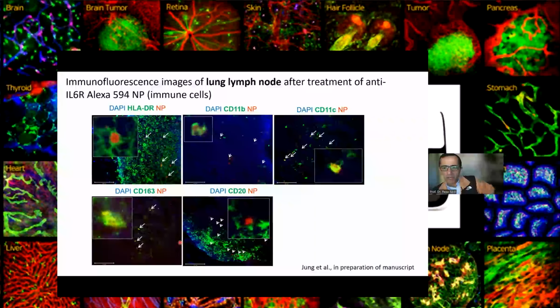And I think I'm going to go on. So we did some lung. This is the image, the intra-lung injection of nanoparticles. So we don't need to image the primate, but I think we could pretty much image the lung in preservation, because you can keep these tissues for at least 6-7 hours. Some of them are on pump for, let's say, 48 hours, right? So it would be really, really exciting if we can image the organ on a pump.